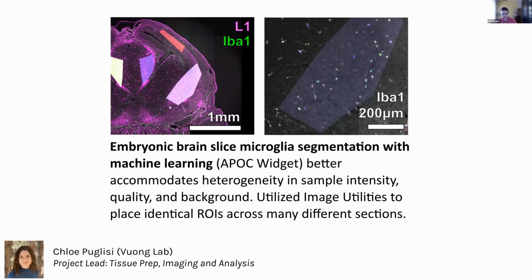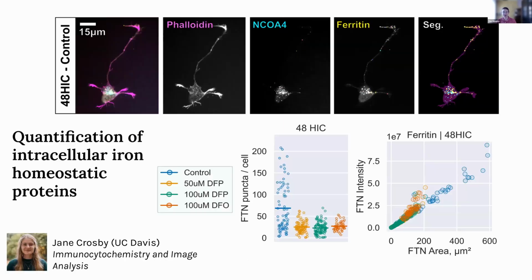And this was work done with Chloe. She has some of the most challenging work for this and has really pushed the progress of the development of this plugin. And finally, here's my work where I intend to use machine learning to train classifiers to segment really challenging cell morphologies.